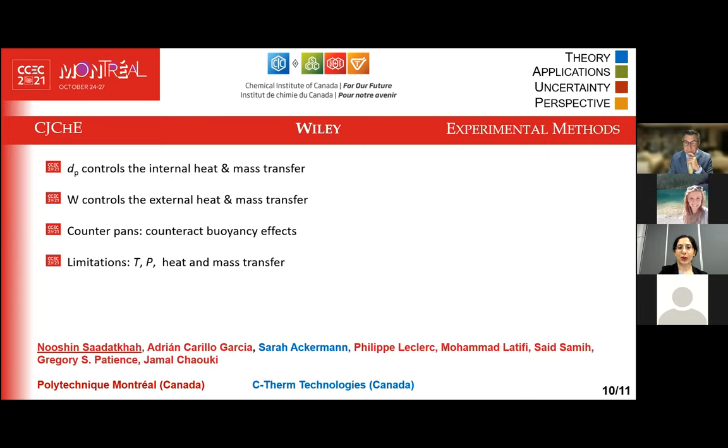So if you want to study a reaction at higher pressure, common TGA equipment cannot do it for you. And I talked about the heat and mass transfer limitations of TGA equipment and the novel TGAs that maybe you cannot find in the market, but you can design yourself. They are fluidized bed TGA, microwave TGA, and induction heating TGA, to maximize the heat transfer and remove the error of heat and mass transfer from the TGAs.